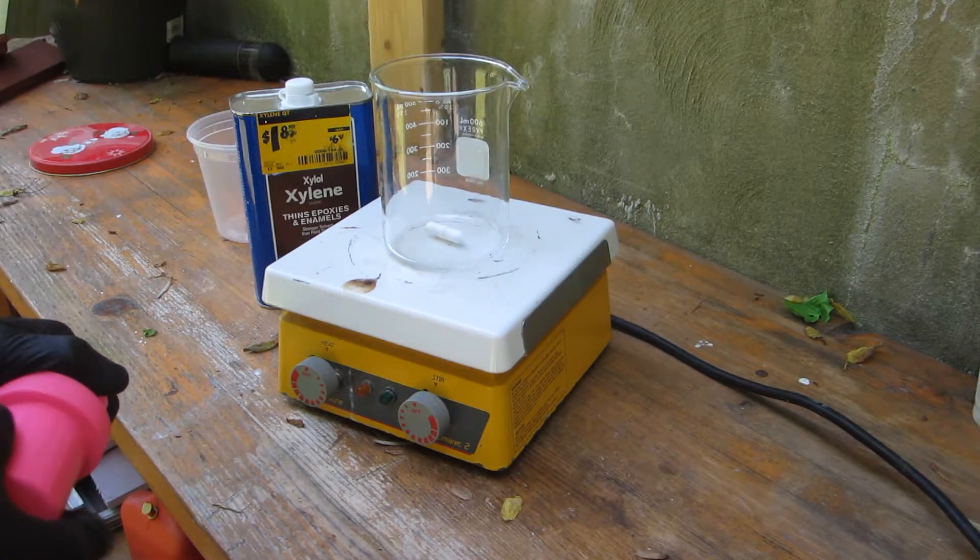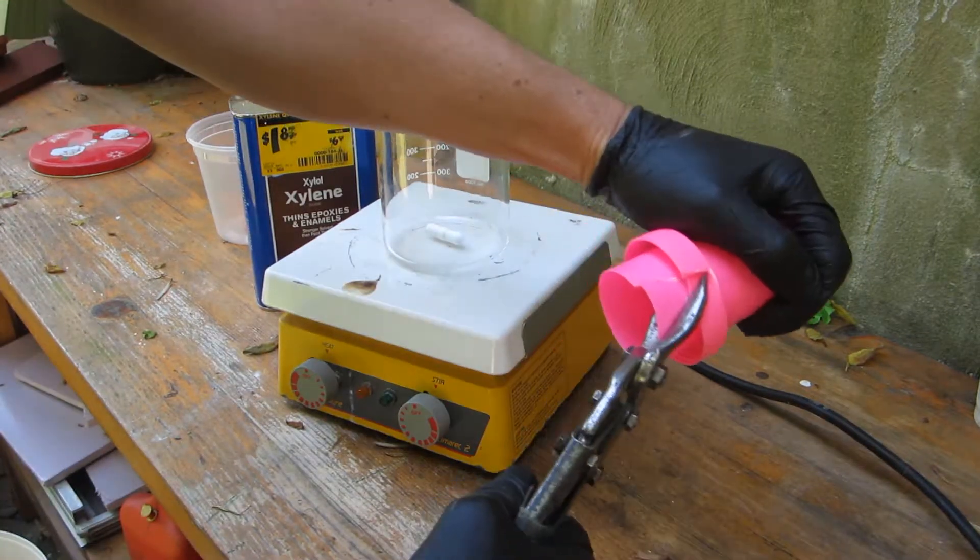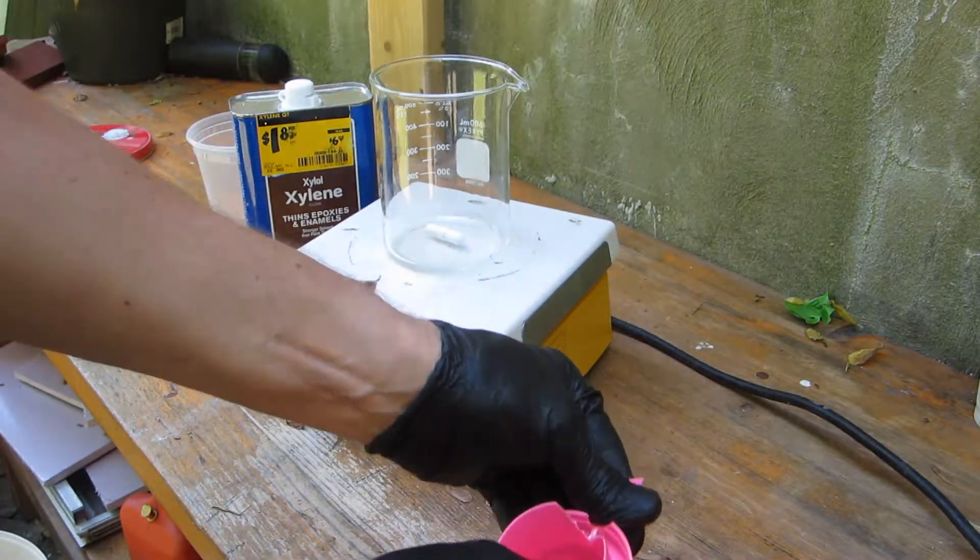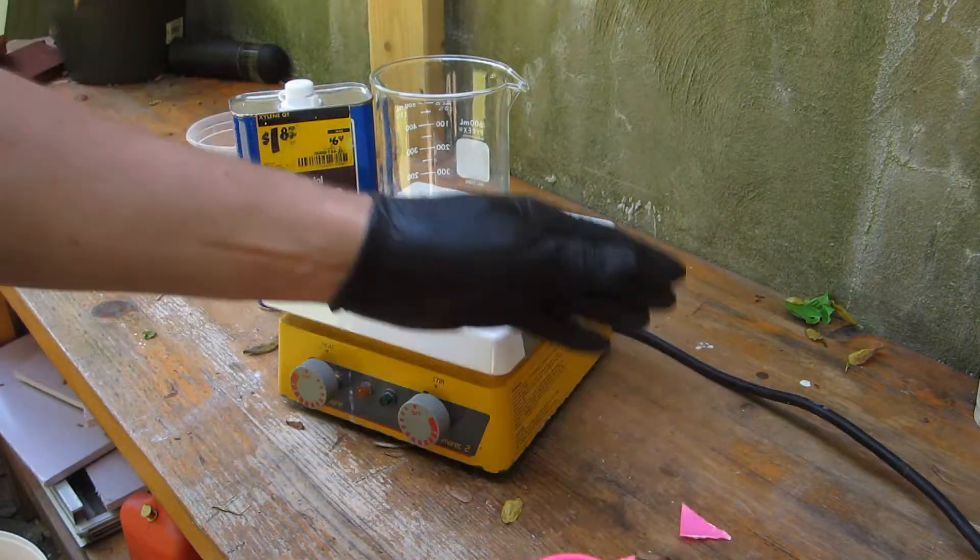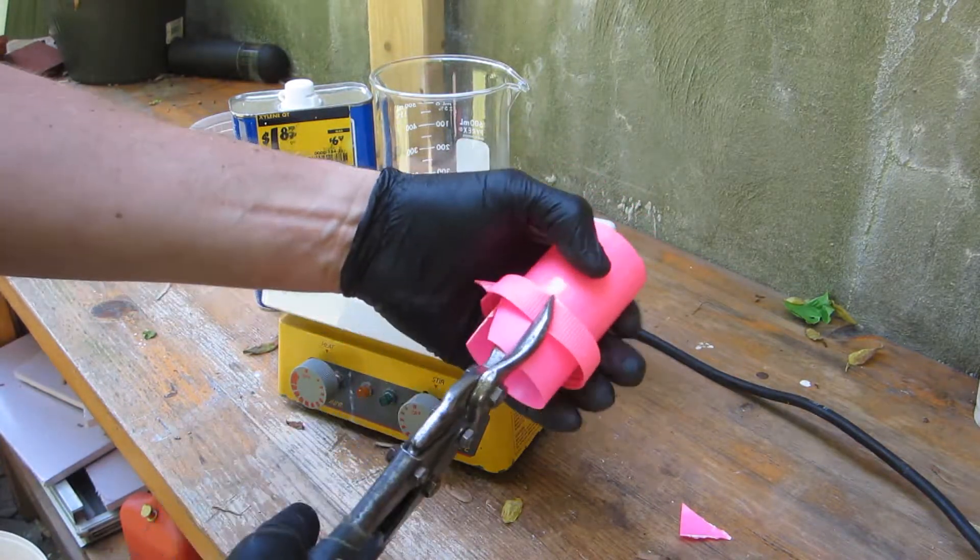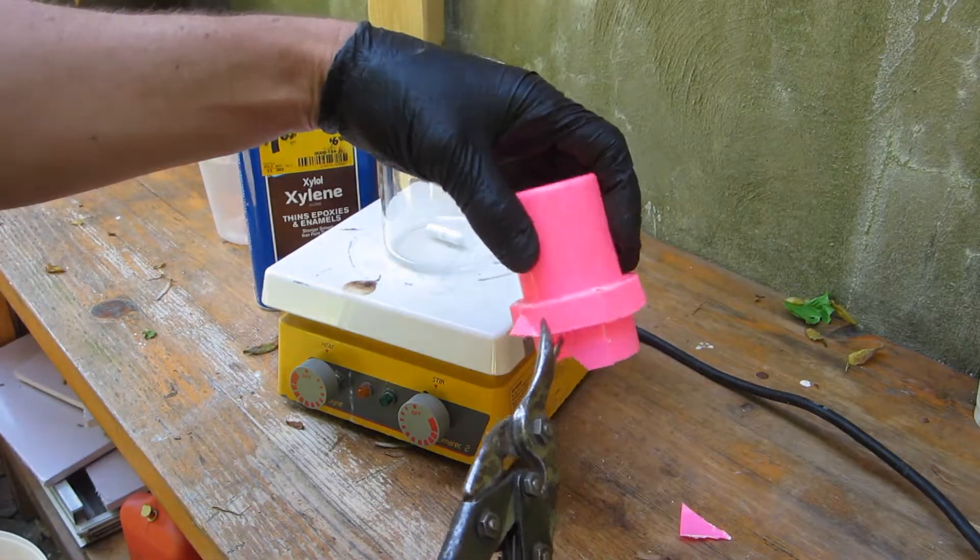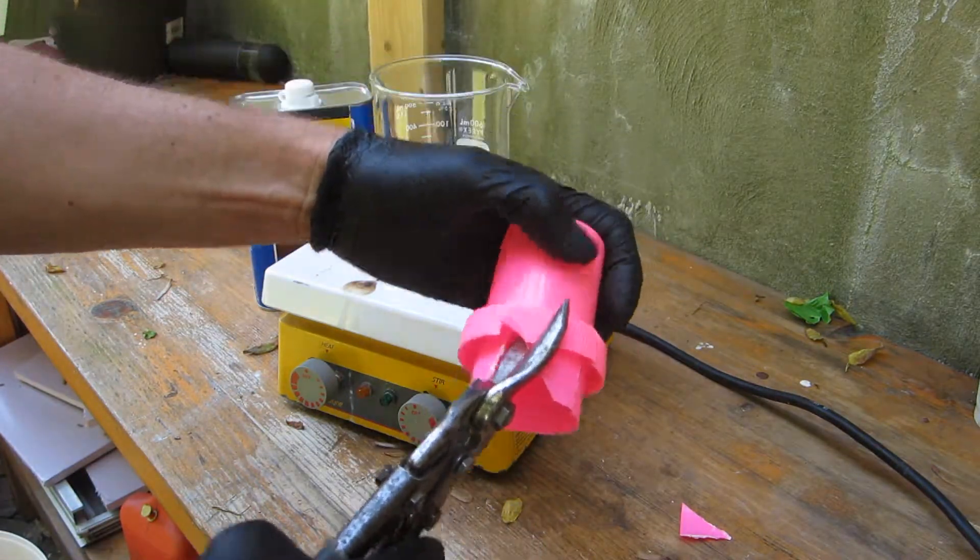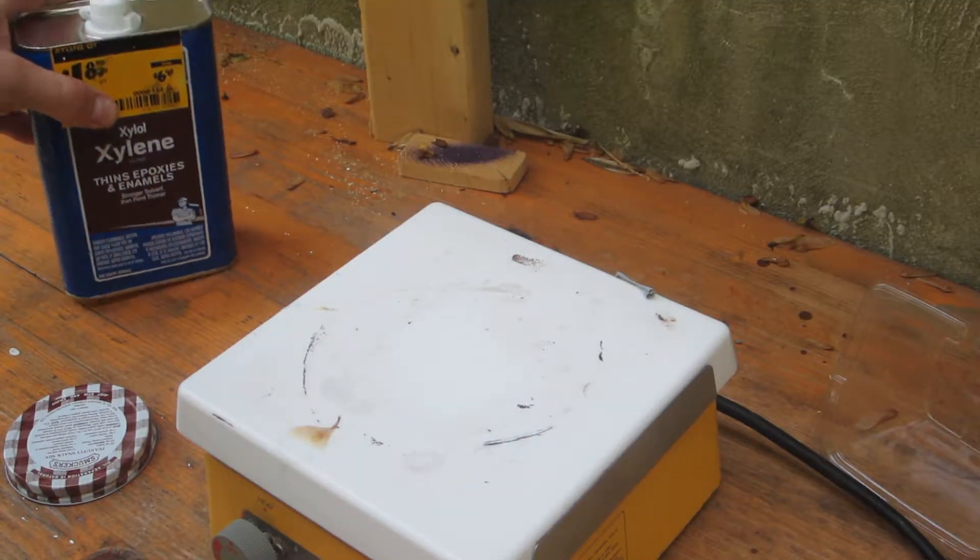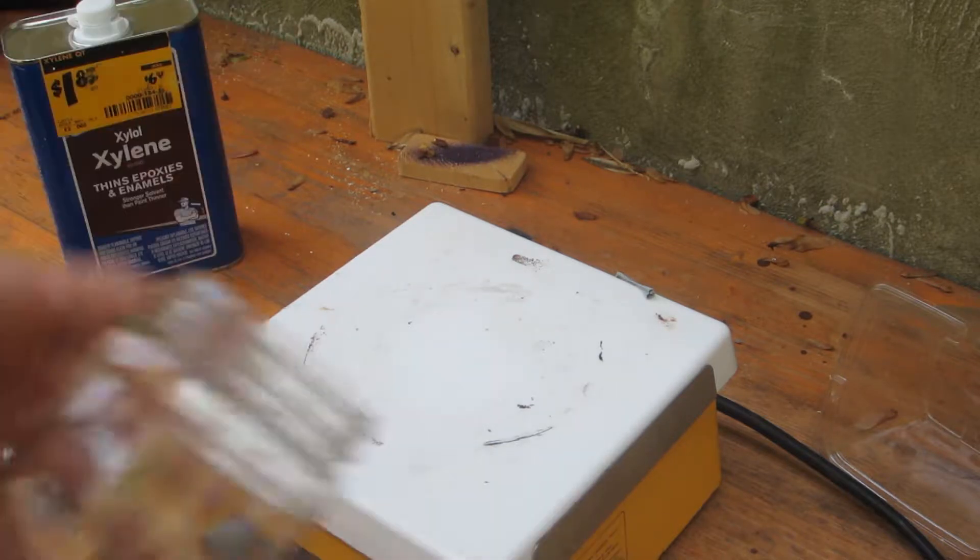We're gonna try and heat up some number five plastic, cut some pieces of this and dissolve it in the xylene. To be honest I did have a go at dissolving PET, that number one plastic, in xylene without any success at all. That stuff is crazy. We're gonna give another shot at dissolving some plastic and seeing if we can make anything out of it.